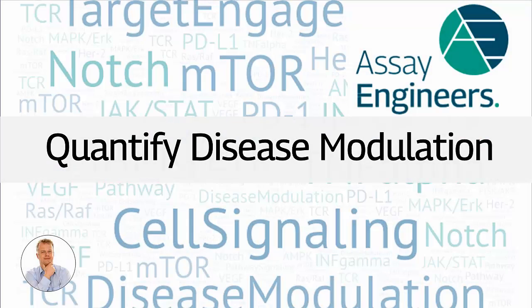Welcome to the AssayEngineers. In this video I show you how to use the Hyperplex biomarker configurator. Hyperplex protein profiling is a breakthrough, powerful technology that profiles more than 800 protein markers with a dynamic range of 5 logs from just 20 micrograms of sample.